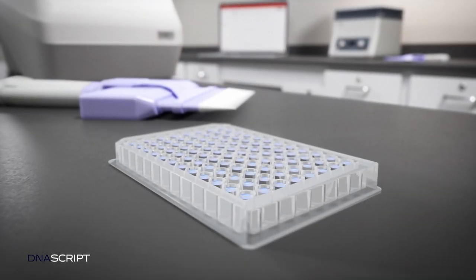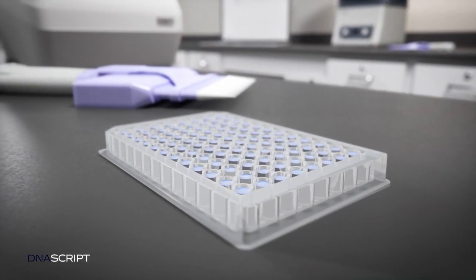Synthesis is now complete, and the resulting oligos are ready for use in your experiments.